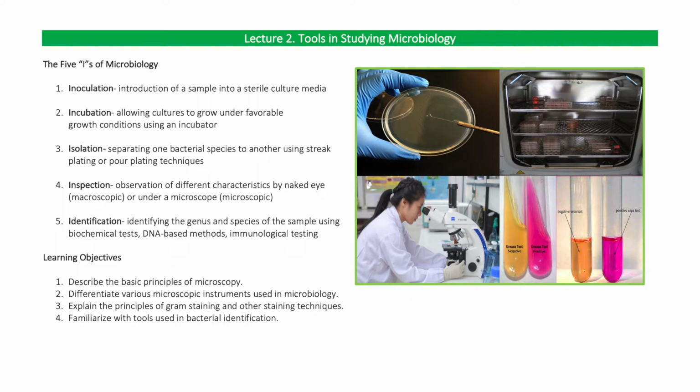Learning objectives. 1. Describe the basic principles of microscopy. 2. Differentiate various microscopic instruments used in microbiology. 3. Explain the principles of gram staining and other staining techniques. 4. Familiarize with tools used in bacterial identification.